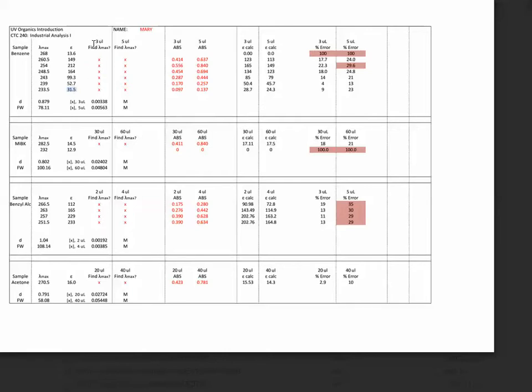What I've done in the next column is I've made a column with three microliters and five microliters, and I've just put an X here, meaning I found those. So when I ran the five micro, I don't have an X in the first row because maybe I had a hard time picking up the 268. This shows me, yes, I had a hard time picking up the 268. From that point on, the 260, the 254, the 248, I was able to find those. So I denote that with an X on the spreadsheet to let you know and to let everybody else know that I did find this wavelength, I did find this lambda. And I'm reporting that, and I've attached my UV-Vis spectra to that to prove that I found it. That's what these two columns are going to be representing here.